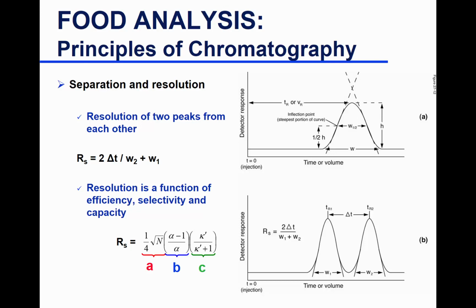The peak is this. So here, as this comes out from here, actually, let me draw it down there, maybe a little bit higher so those in the back can see. Let's say the column ends here.